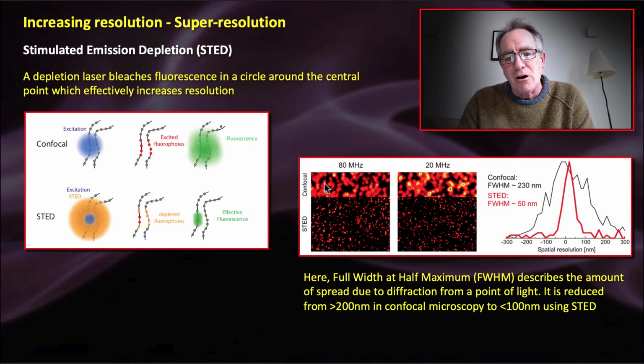You can compare confocal images of particles that have been excited with STED images of particles that have been excited. Very same magnification, and look at the difference. Look at the resolving power of this STED system, how beautiful and clear those little dots are. And what's happened there is that the width, black line to black line, of these little dots here has been reduced.